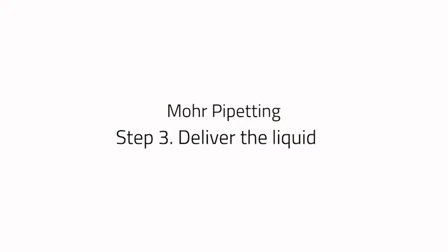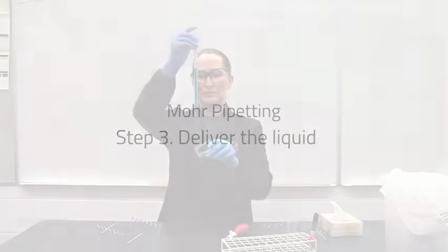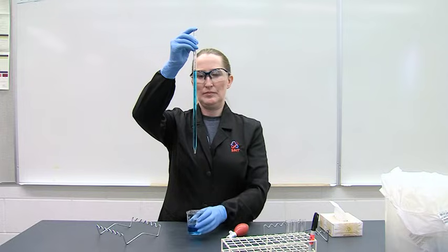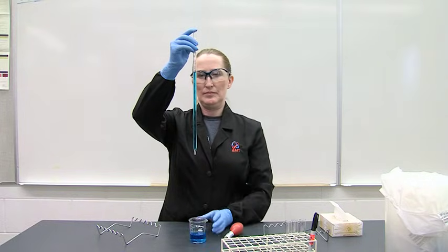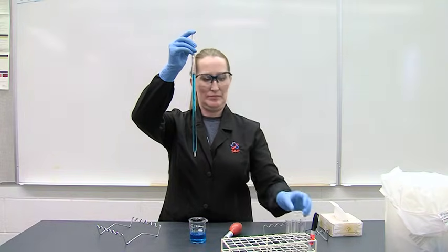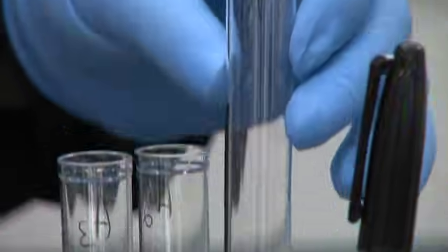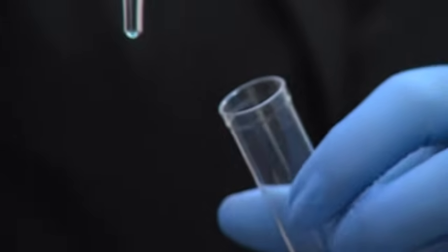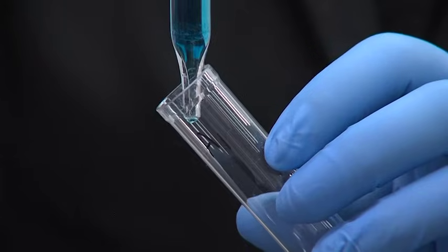Step 3. Deliver the liquid. Move the reagent beaker out of the way and angle the labeled receiving vessel into position. The pipette remains vertical. The tip of the pipette touches the side of the receiving vessel.